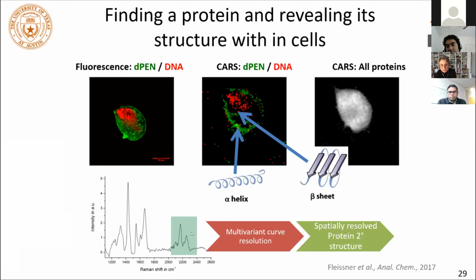In terms of intensity for the excitation or illumination, it was always necessary to really blast the cells quite a lot. But you do live cell CARS imaging now, so I think that has improved. Maybe a comment from you? Yeah, I think it's still pretty high. I don't think it's lower, but you get saved by the fact that you're not doing it with a CW 532 laser pointer, right?